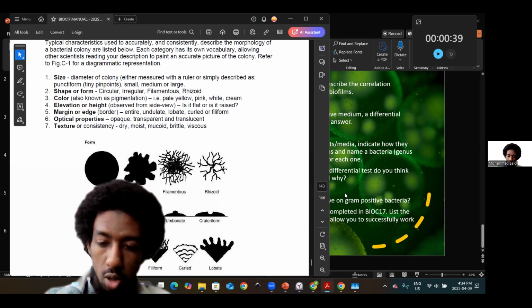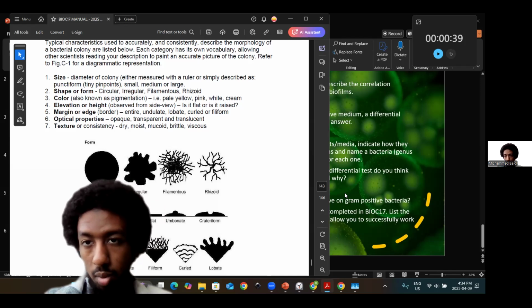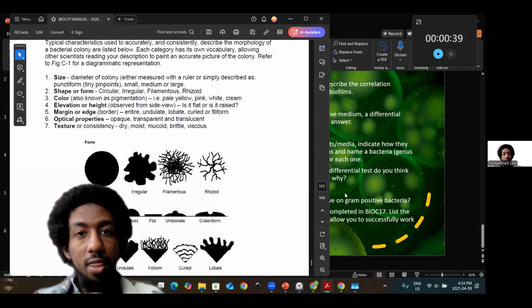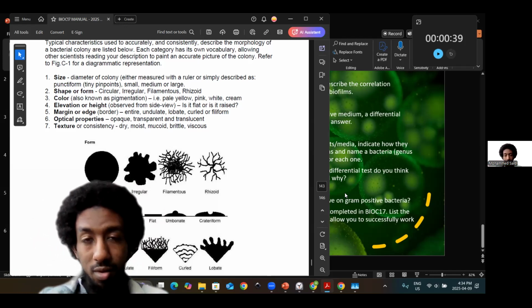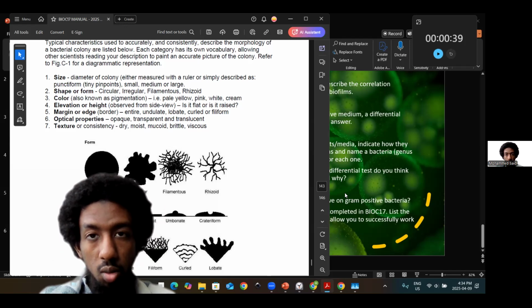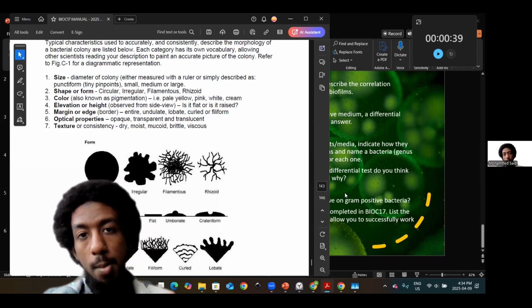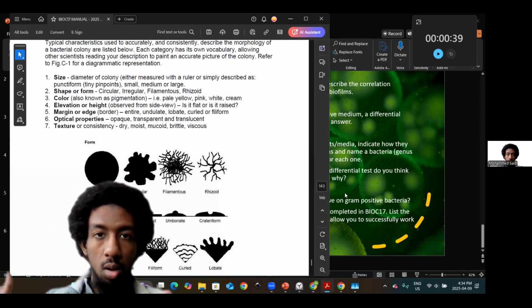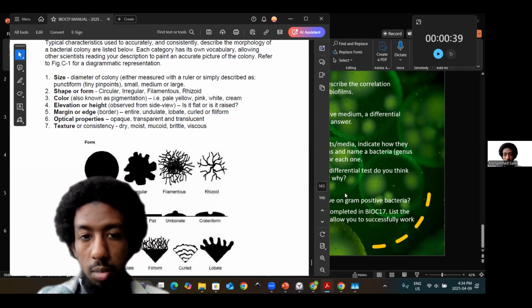If you use a cotton swab and smear aseptically from the zone of inhibition into a separate plate for further growth, then post incubation, if you find growth in that plate, that exhibits bacteriostatic inhibition of your antibiotic on the bacteria. Whereas bactericidal means there would not be growth.